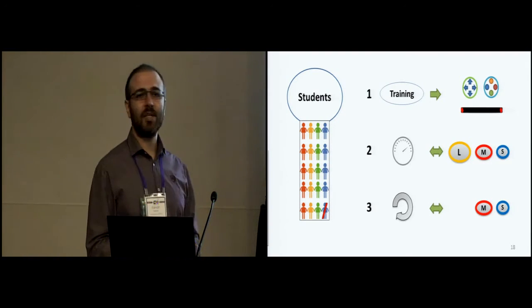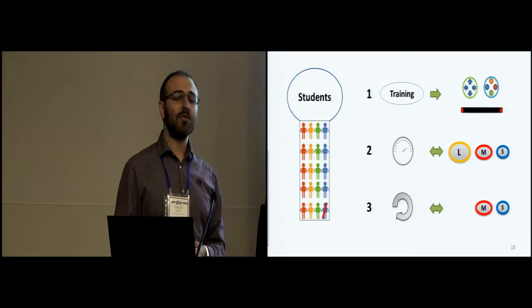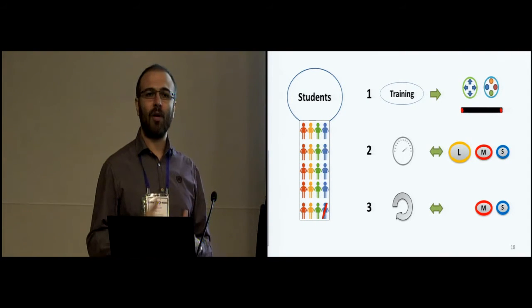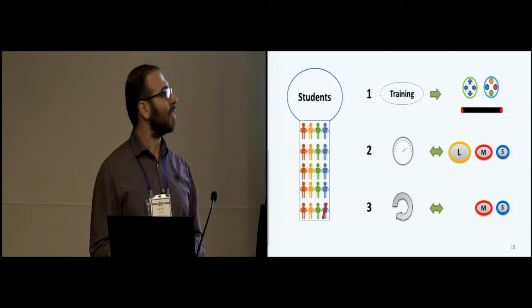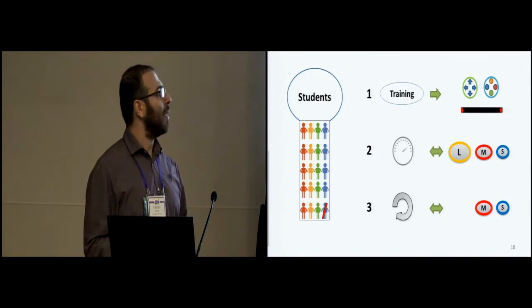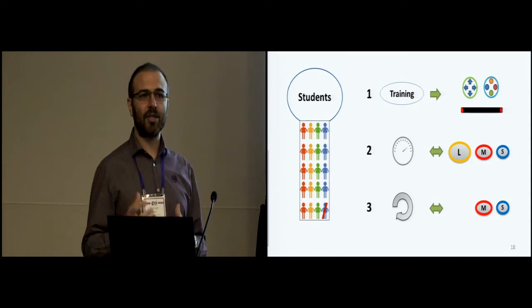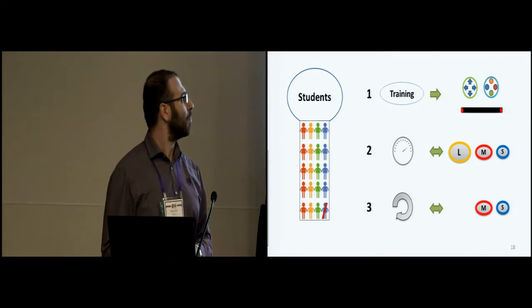In the first stage, the training phase, the participants first gave their consent for this experiment, and they were trained for different fiber morphologies in these categories, and then they were trained for using the gamepad for panning and zooming and starting and stopping the tracing. They were also informed about the eye-tracking interaction, and a 9-point eye-tracking calibration was performed.